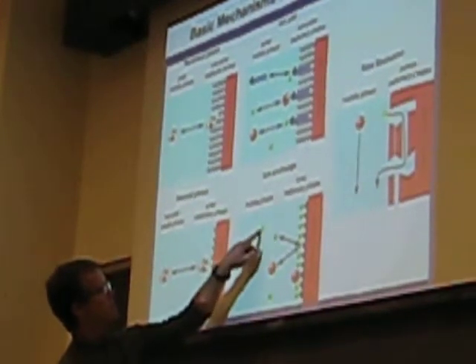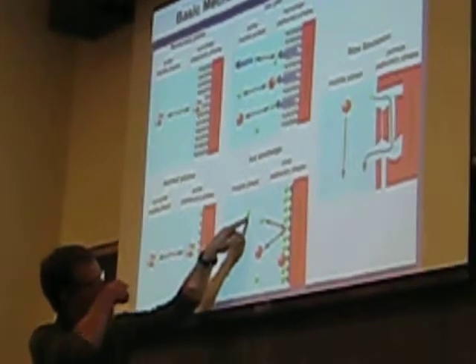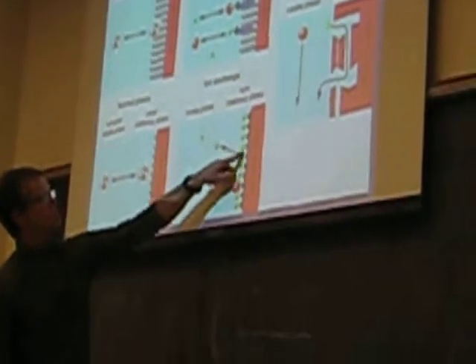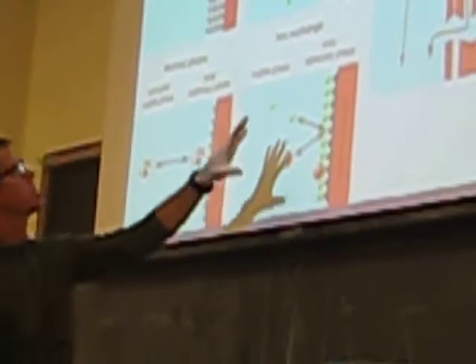And so here you have, in our case, some buffer, a mobile phase buffer that has a dissociating buffer that produces these cations that are weakly associated with the anions of the stationary phase, that are outcompeted by the stronger partitioning of the anion and cation with the stationary phase, right? We just talked about this.